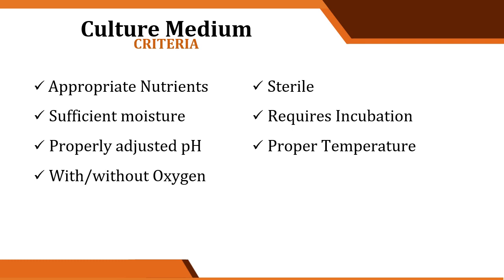Okay. So, next is sterile. So, the medium should be initially sterile. Okay? Para when we culture, once we added an inoculum, kung ano lang yung gusto nating i-culture, yun lang yung makikita natin. Kasi if hindi siya sterile, umpisa pa lang, so parang nawala na siya ng purpose. So, hindi rin natin makukuha yung mismong bacteria na gusto nating ma-isolate. Okay? So, we sterilize our medias using the autoclave then. So, 121 degrees Celsius for at least 15 minutes then.